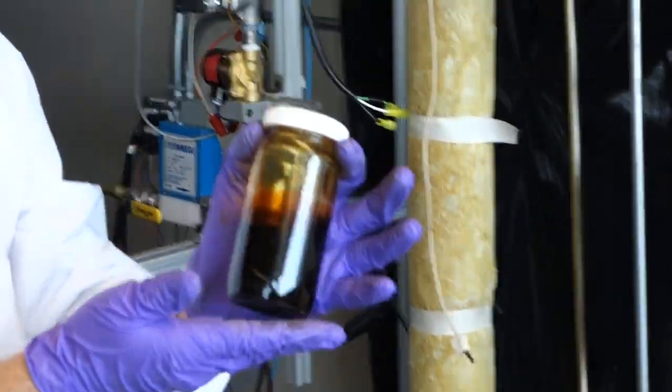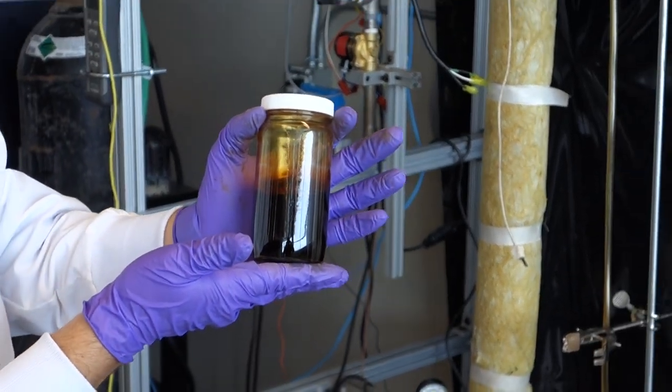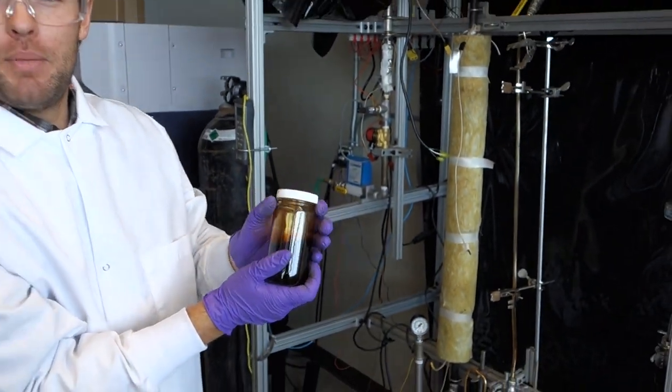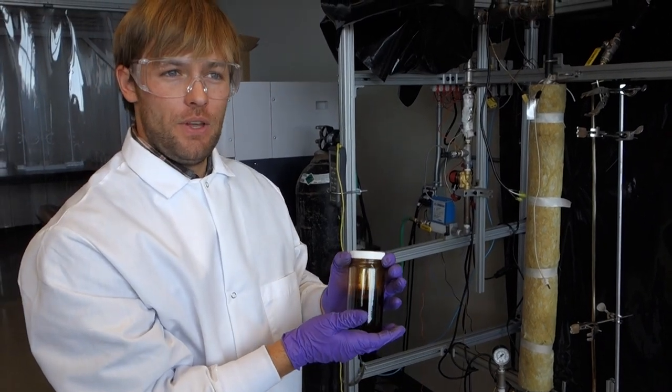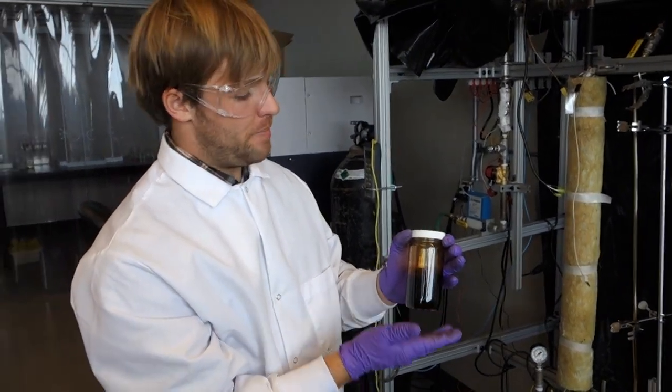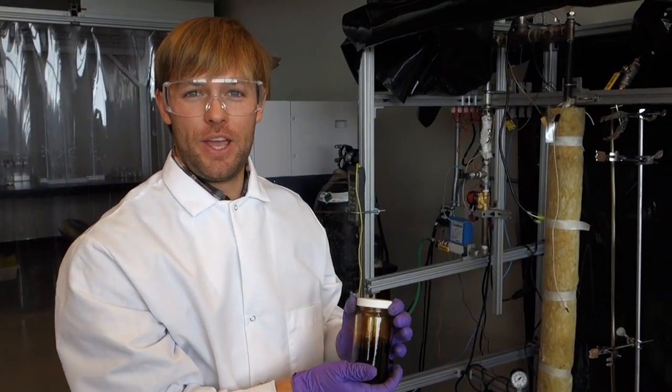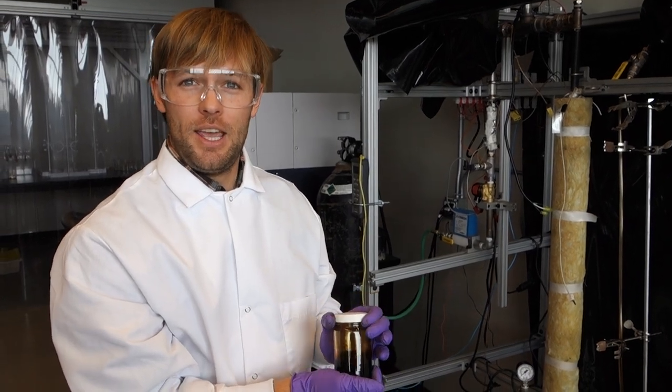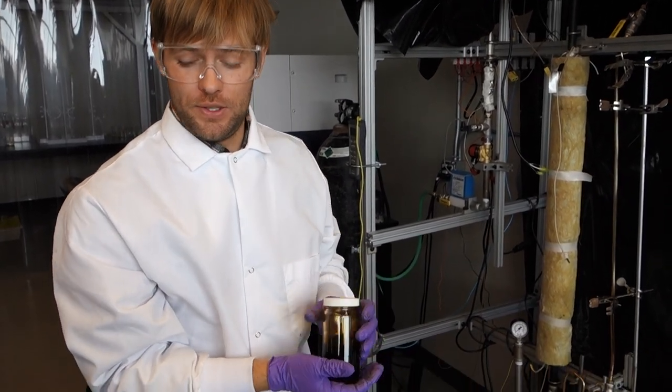This is what we collect. This is called bio-oil. It's very similar to crude oil, but it has some differences. One of the biggest differences is it has a very high oxygen content, and our future work is aimed at reducing this.